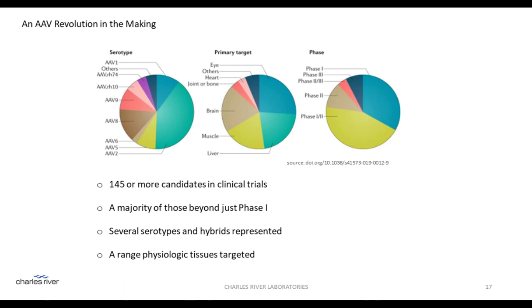Certainly, given the rationale that the species distribution profile of these diverse products should be carefully and individually assessed in accord with tox and potency data specific to these individual products, the importance of methods like AUC becomes apparent, which I think makes it a good time to show you just indeed what AUC can do.